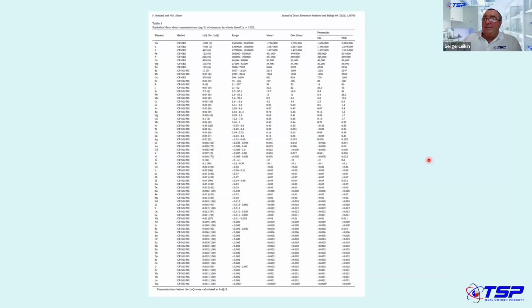One of the interesting things that we did when we ran this was we ran into the issue of matrix match standards. Typically people fully matrix match with direct blood, getting the blood from blood banks. The problem with that for us at that time, I think it was COVID time, was that the blood was not readily available. That's number one. Number two, even if it's available, it's hard to find blood that will be clean for certain elements.